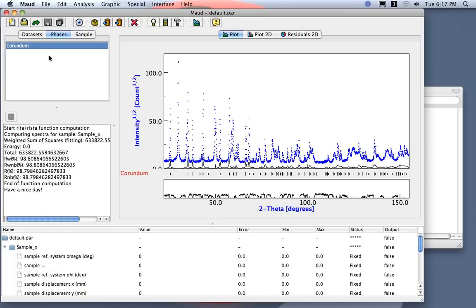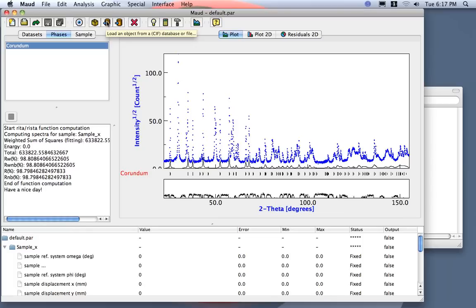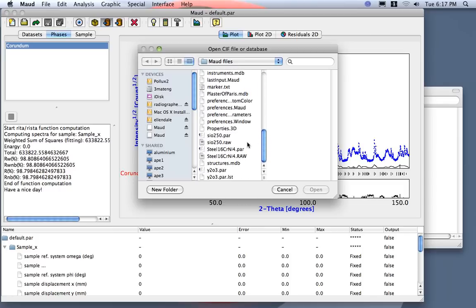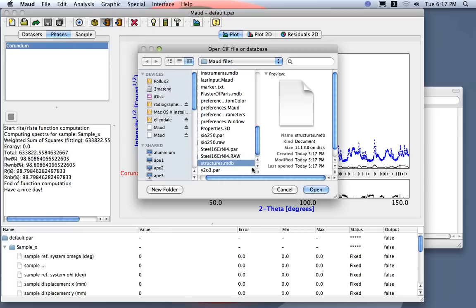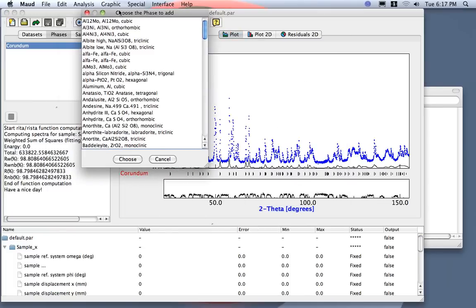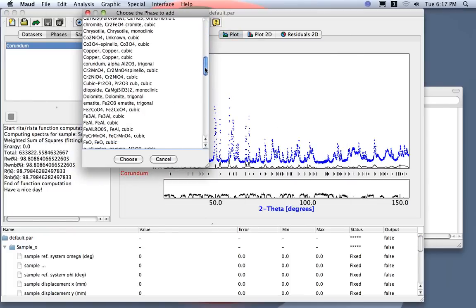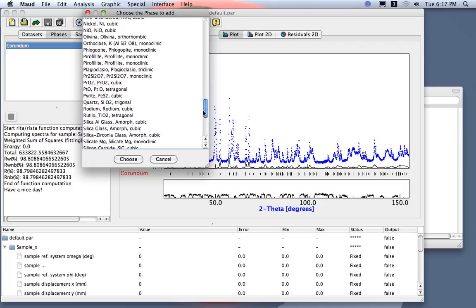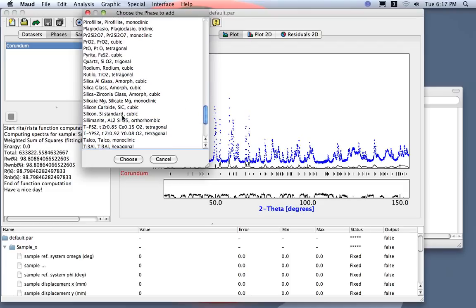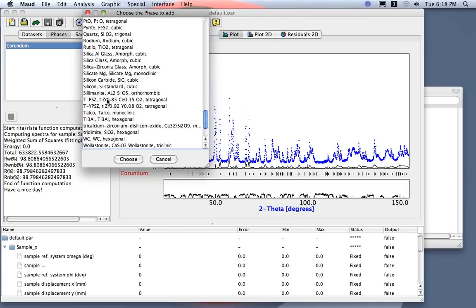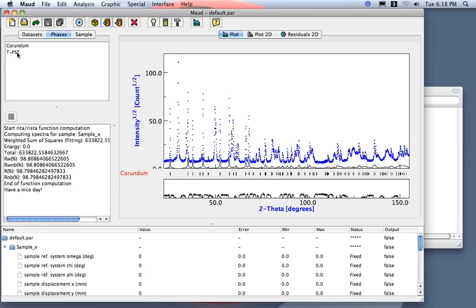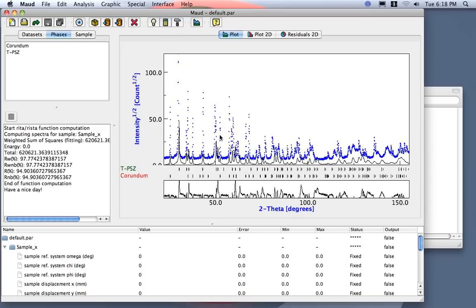Now, the second phase is a tetragonal zirconia stabilized with ceria. So, I can also load this one from a database. I can use this one if I can drag and drop, or use this one here, or just go edit and load the CIF file from the database. Now, if you want to load the CIF file containing phases, you should stay here under the tab phases. Maud recognizes the object base or where you are. Now, tetragonal zirconia is inside here. It's not exactly the one of these examples. It's one very similar in composition. Now, I have the two phases. And I can compute to see if the second one is matching.